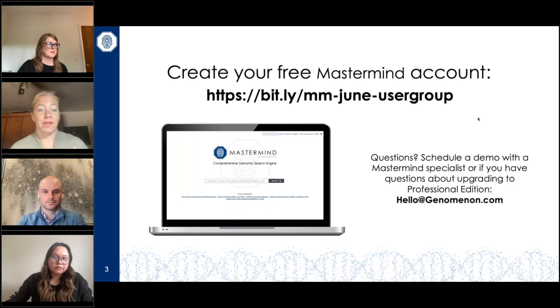I will expand on this. Another common question we get is, do you take in historical nomenclature? The answer is yes. But in a case that you think we have missed something, people were leaving out exon 1 ten years ago, and that means there's a 40 base shift. If you think we don't have that 40 base shift in our system because you're not seeing it, please let us know. We have the ability to do that in a gene specific manner. We can say, okay, we know in one gene there's a 40 base shift, or an author left out the first nucleotide or didn't count it. We can absolutely take that type of information into account. So it depends, and we'd love to see your examples, because we'll make sure to correct that in our pipeline.